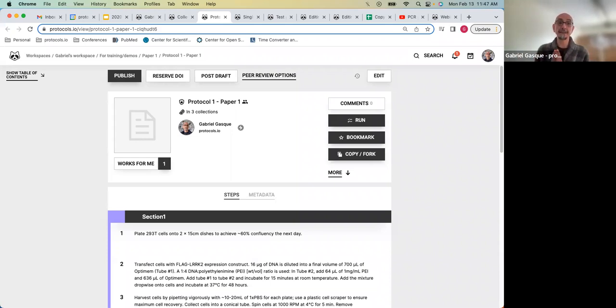If you're asking whether it is best to share using the share button or to bring people into the workspace, it depends on how collaboratively you want to interact with your colleagues. If you are working with your colleagues on a whole project that contains many protocols, I would recommend that you create a workspace and bring people into it so you can all work on the protocols simultaneously.